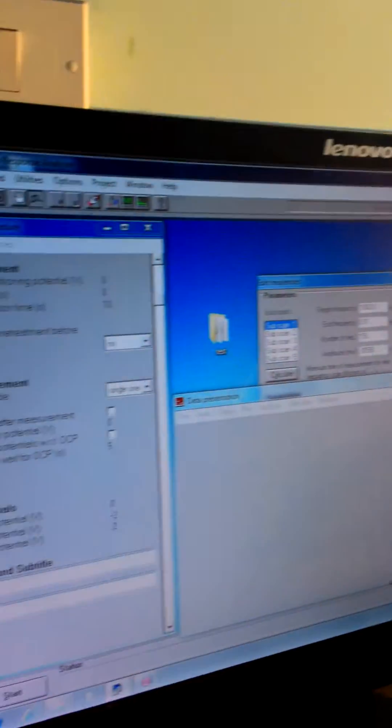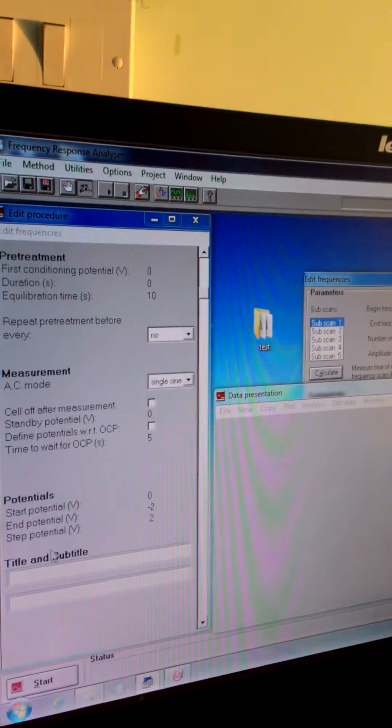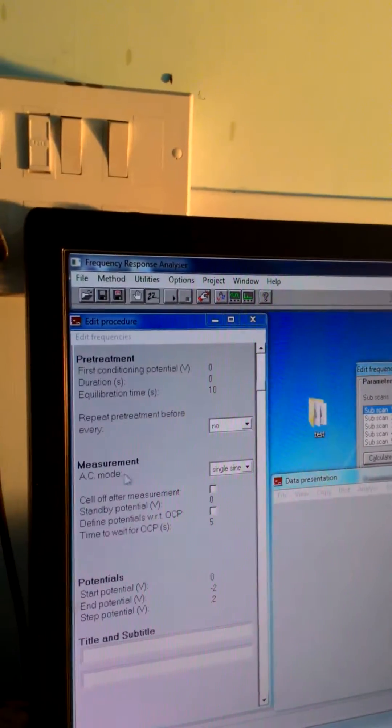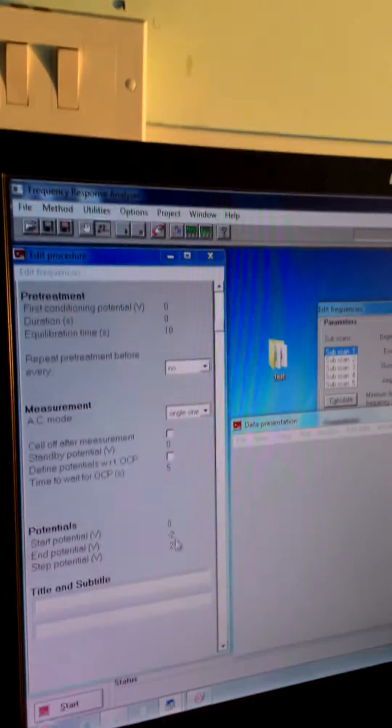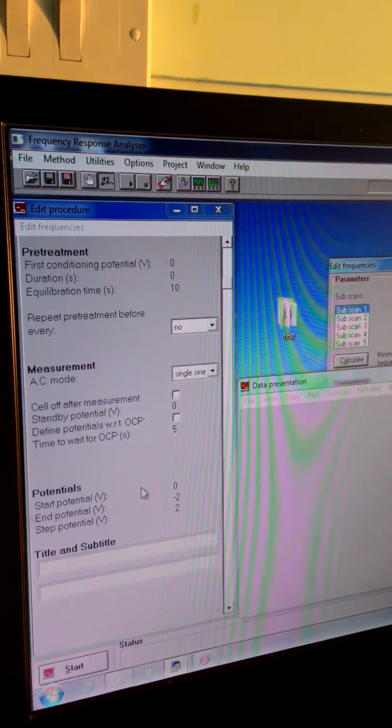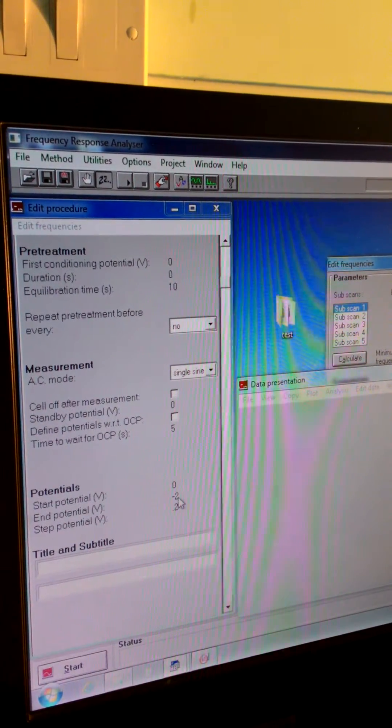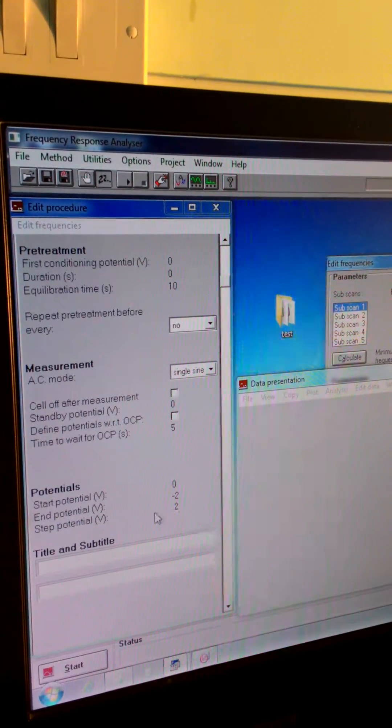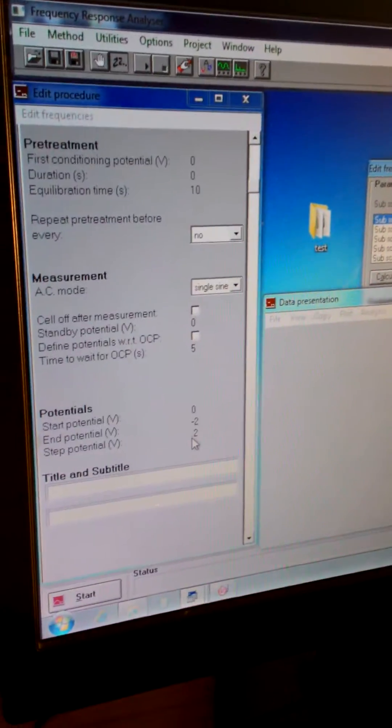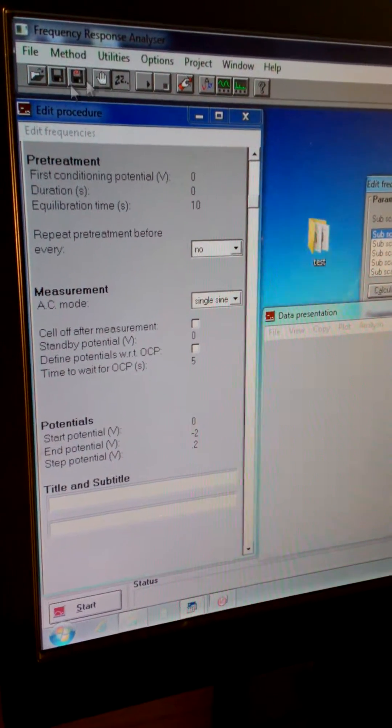Now this you can do now, that potential thing from 0 to minus 2 and step of 0.2, so it will be total 10 points.